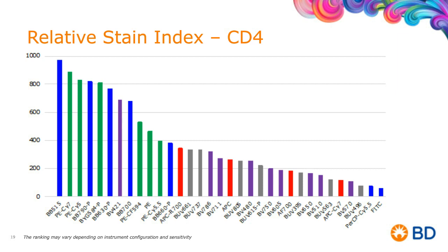But also, there is a caveat about that color. It's not bright on every specificity. So learning about every color is also foundational for everything. That one color is very different than most every color that we've ever used in flow because it's not consistent. But in CD4, you can see the difference between that.